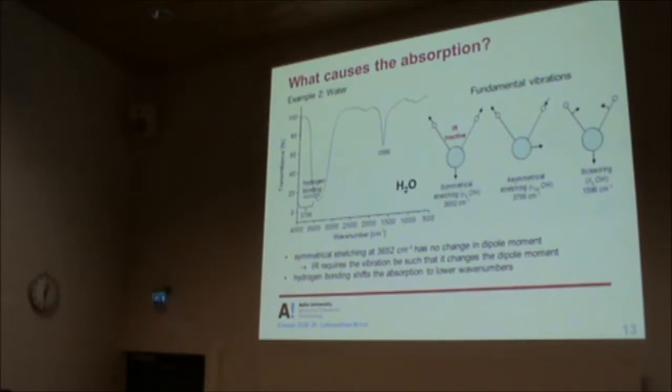The OH stretch will envelope the entire region, so you will lose all the information you are supposed to get here. That's why in infrared spectroscopy you will always be advised to dry your sample thoroughly so that you don't get interference from this. This is one major difference.